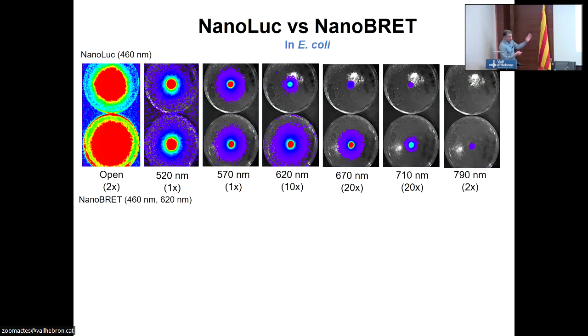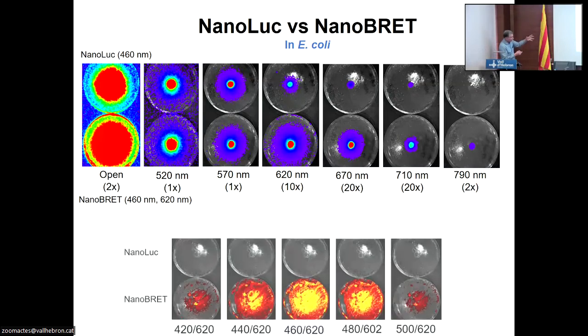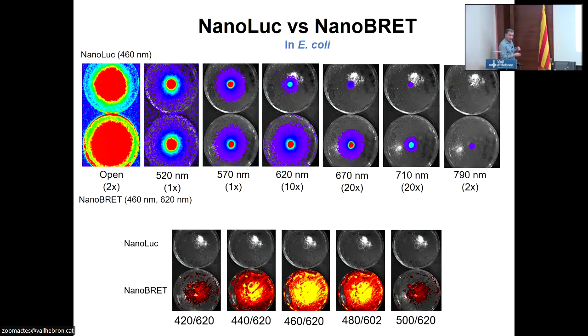But the other beauty of this system is that this is a fusion protein, and it's also fluorescent as well. So it means if you're trying to do FACS sorting or tissue biopsies afterwards, if you want to do in vitro, in vivo, ex vivo, you can use the same reporter to do the whole continuum of this work.